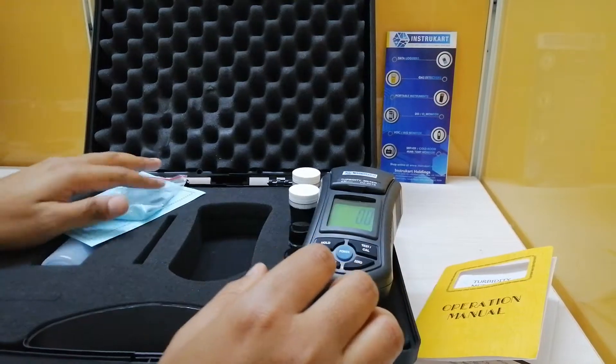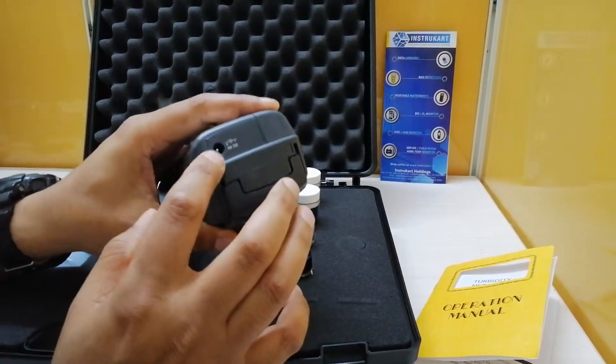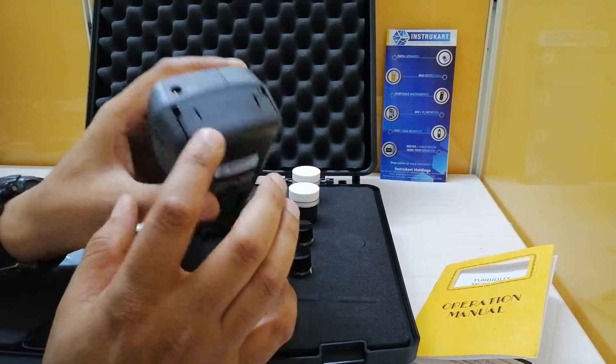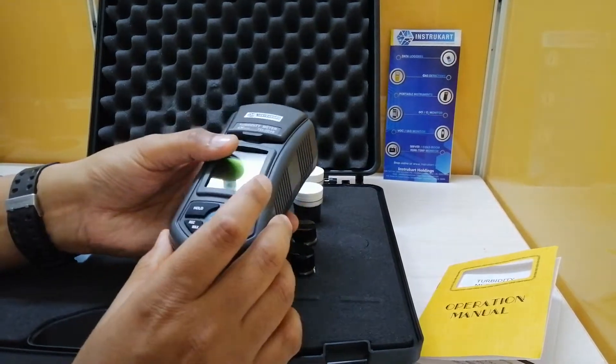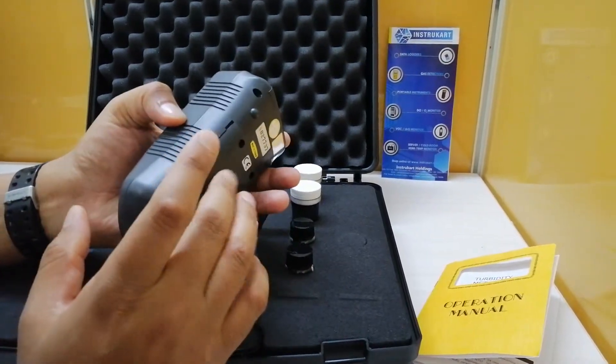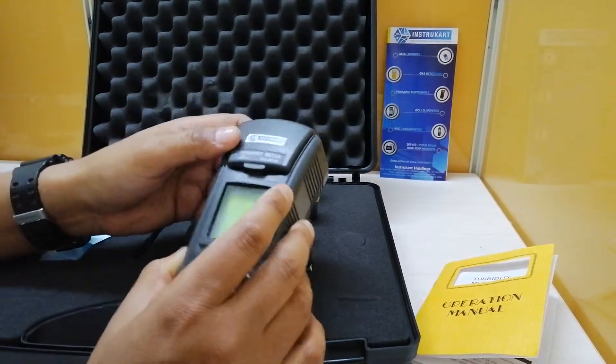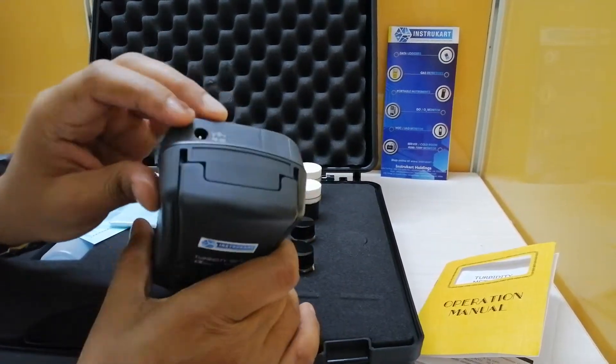Now please note that the charger doesn't come or the power socket doesn't come with this. Should you wish to have it portable use, you can use it with the batteries, six batteries put together, or you can use your own adapter for this.